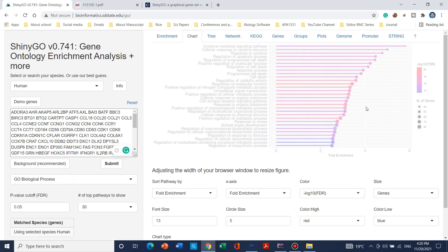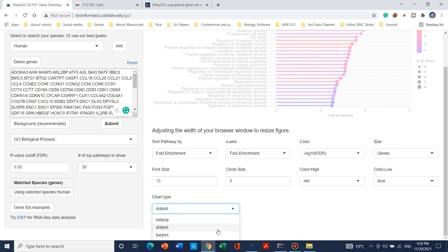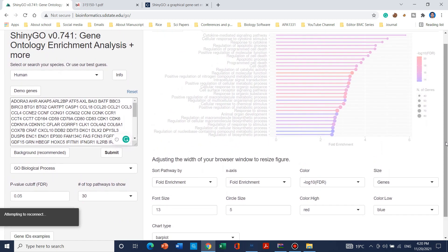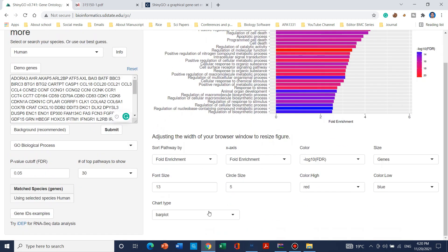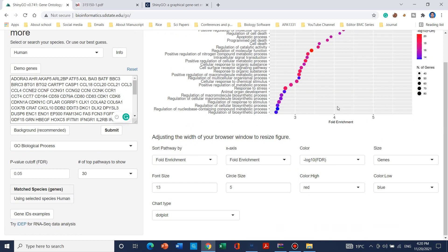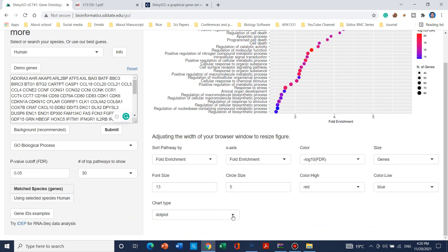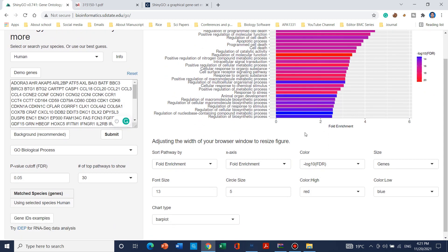After clicking, the website will update the figure in the background. There was a brief internet issue, but when you click on dot plot the website updates in the background and the dot plot appears. Changing to bar plot will make the bar plot visible. It is up to you which chart type, size, and color you prefer.